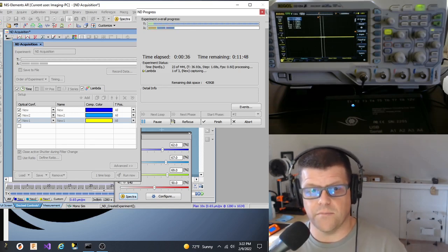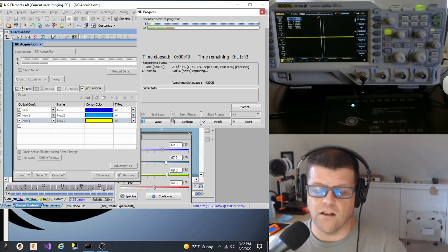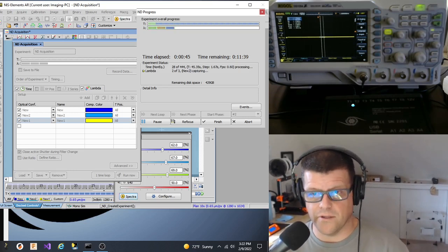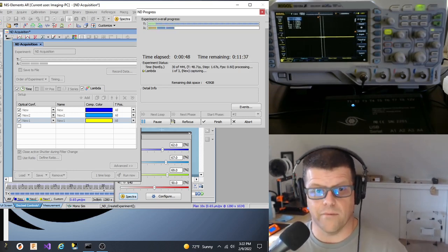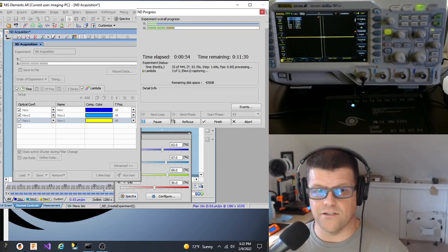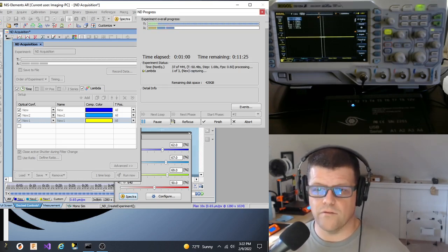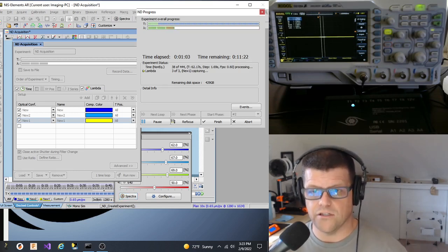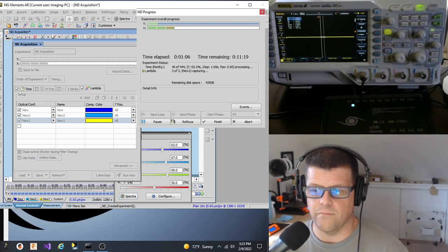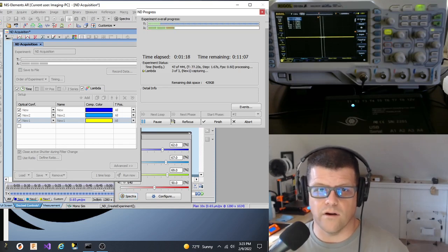In certain cases, we can speed that up, especially if we can exploit the microcontroller on the front end for higher speed responses. And a lot of that delay is simply because USB to serial emulation takes some time, and so we're doubling that time up in both directions. But again, the big picture is, if you've got a stage and that stage is not supported, but there is supported communication on an open protocol, published protocol from a stage company, we can emulate that stage. So in many cases, this will enable you to do things like positional control in software that was not previously possible to achieve, as well as to emulate devices in commercial software that can then support even homebrew devices.